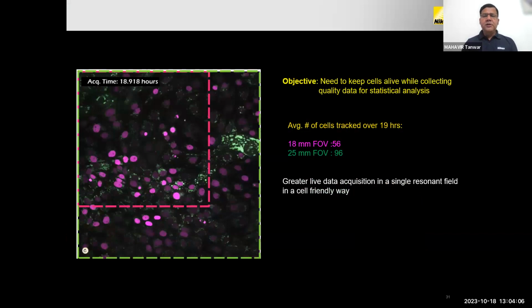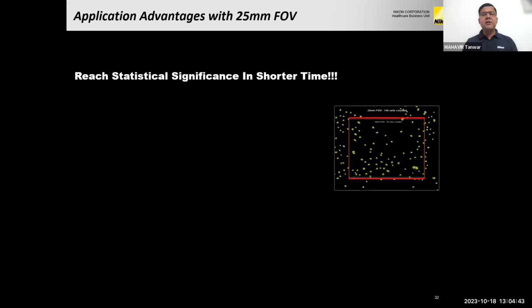The other utility is that confocal images are used, and confocal is performed basically to do quantification, right? Quantification is the key. Besides getting just good images, we have to do an accurate quantification. So if the quantification is done based on the large field of view, the statistical accuracy will be much higher. Let's say with respect to the whole sample, if you are using a wide field of view, a bigger area of that whole sample for the quantification, the statistical accuracy will be much higher as compared to the smaller field of view, because you are taking the estimation based on a large field of view.